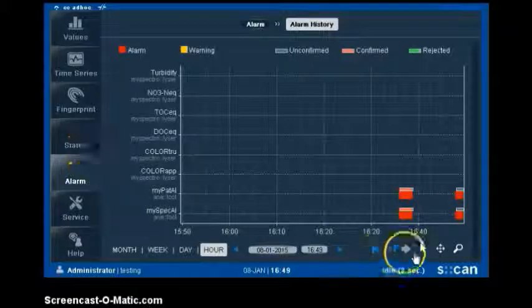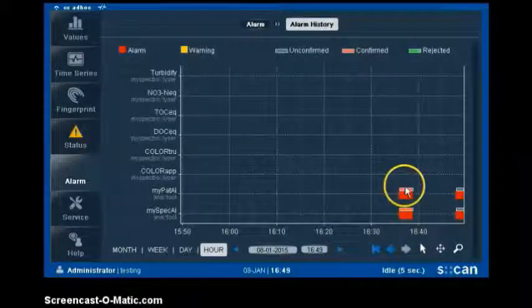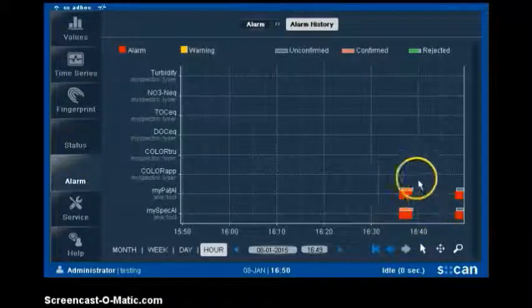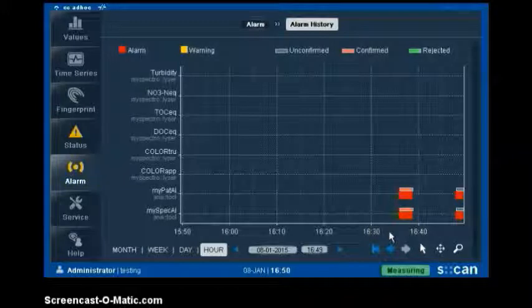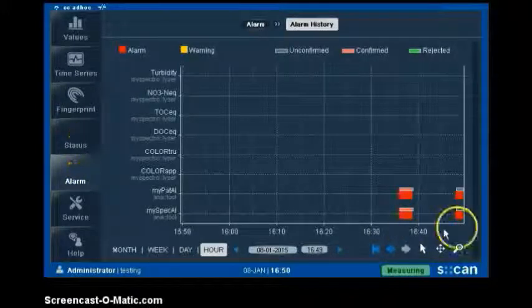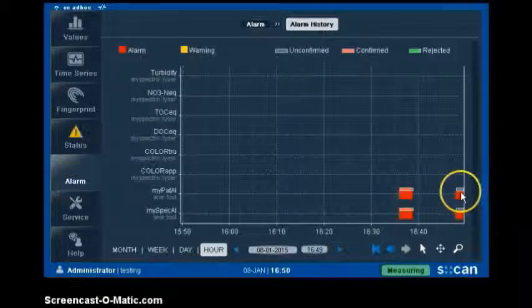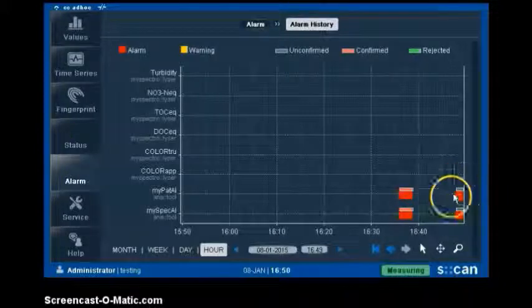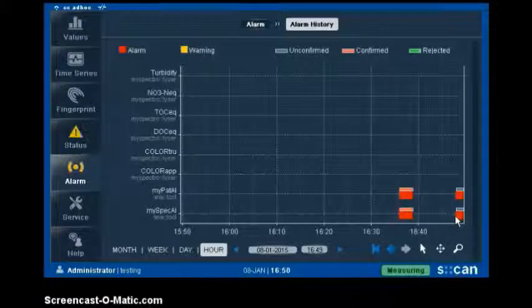If we zoom in, we can see that we have had one event during the contamination with the coffee, and we have a second event that is still going on, and which is due to the contamination with the orange juice.